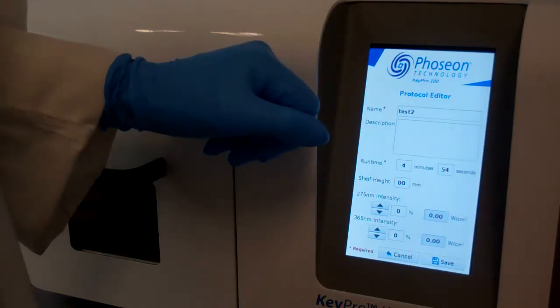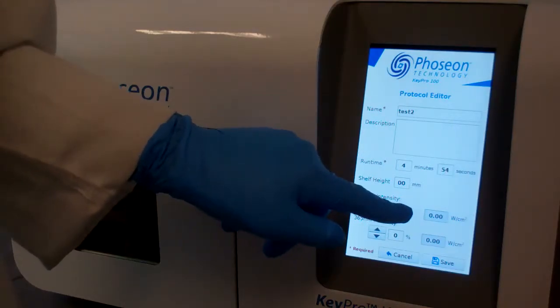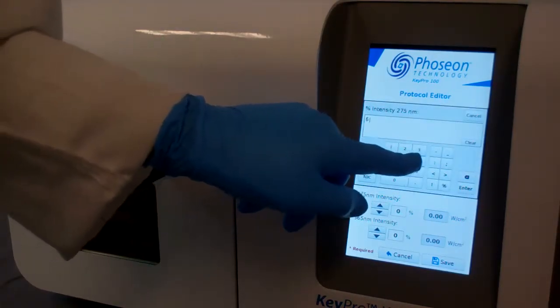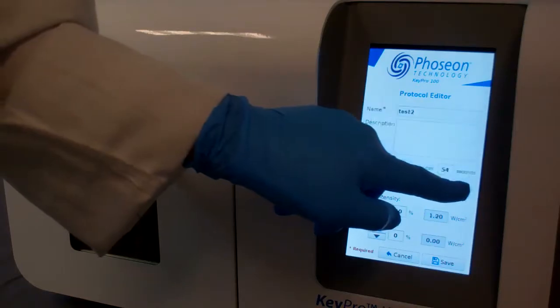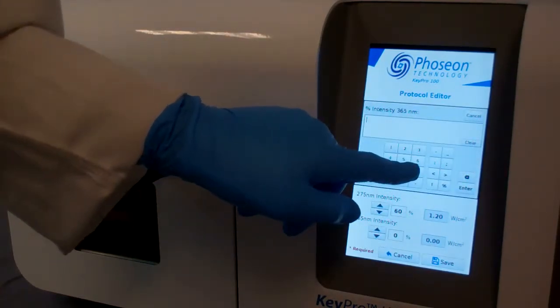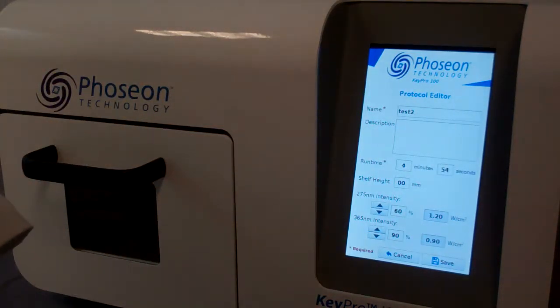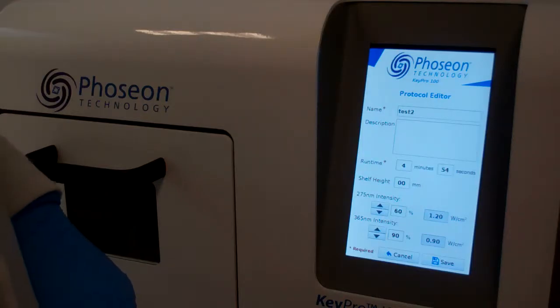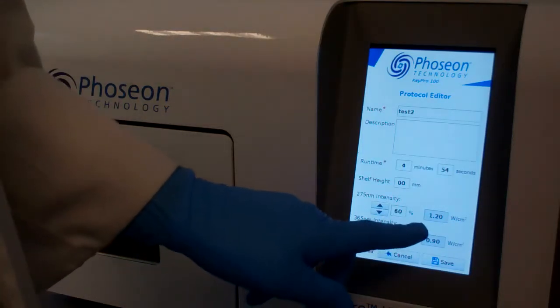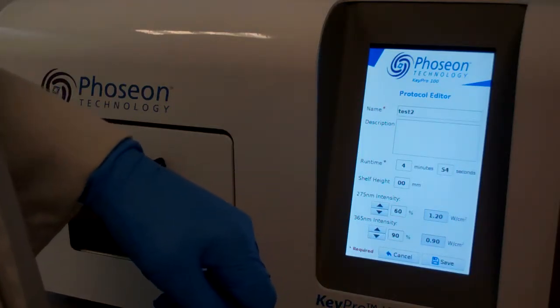Set the intensity by % for one or both channels. The irradiance information is available next to the wavelength intensity programming and is for information only.